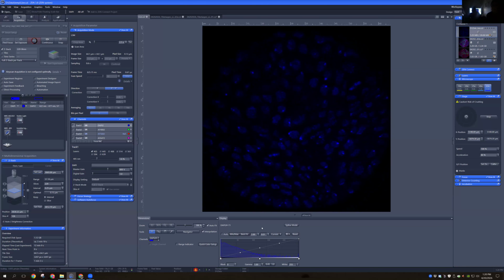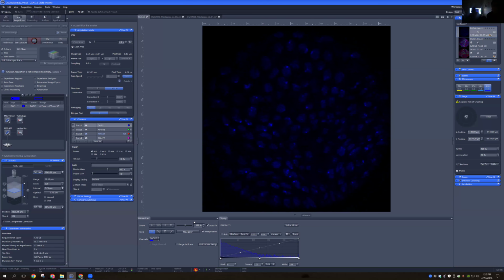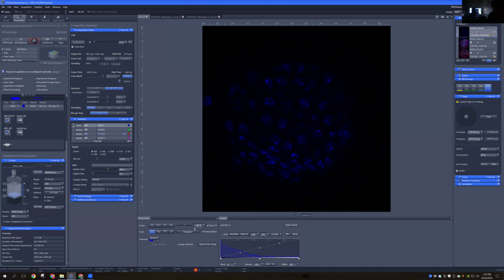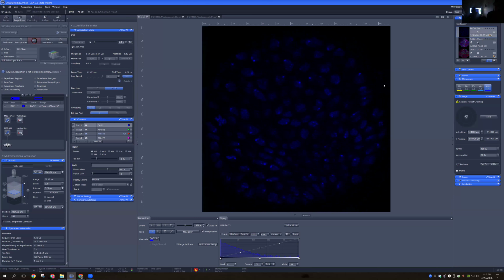All right. The signal that I'm acquiring here looks good. I'm not saturating any of the pixels, basically seeing too much signal from them. The image is entirely within the extent of the screen.